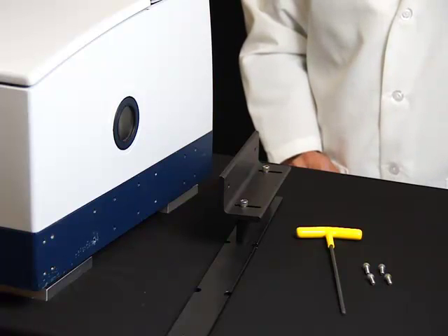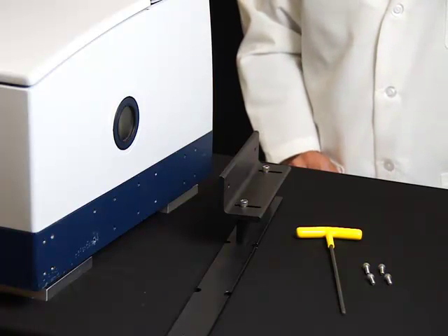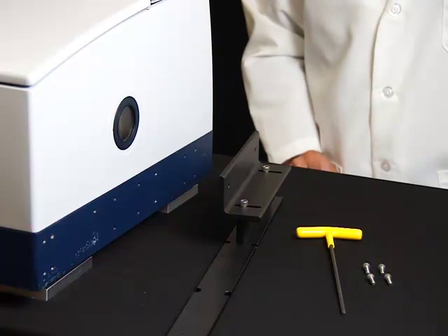Before attaching the accessory to the spectrometer, make sure that the instrument and the PC computer are off.